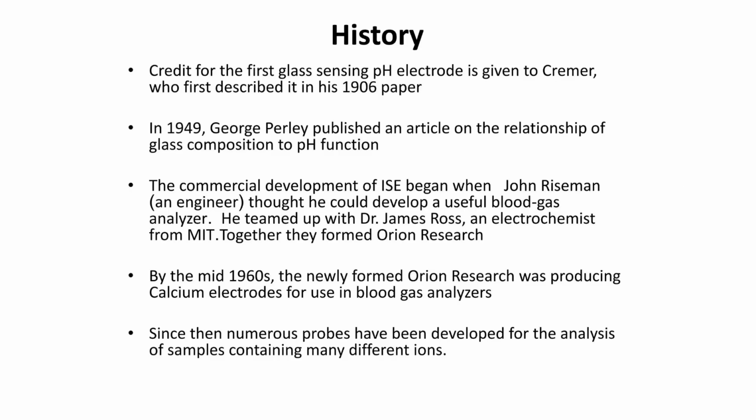An ion selective electrode is a highly specialized electrochemical sensor used under the domain of potentiometric sensors. Its purpose is mainly converting the chemical activity of a specific ion in a dissolved solution directly into a measurable electrical potential. Unlike amperometric sensors, these potentiometric devices measure the electromotive force or voltage while drawing zero current.